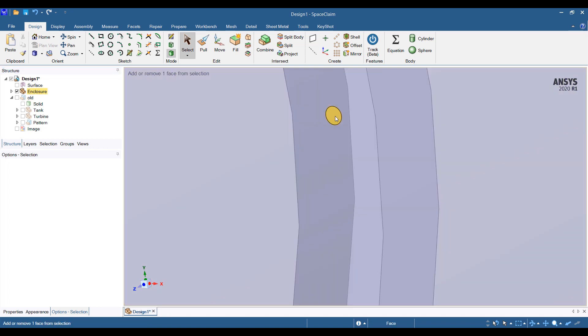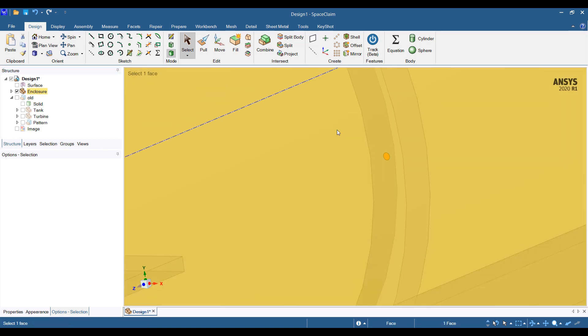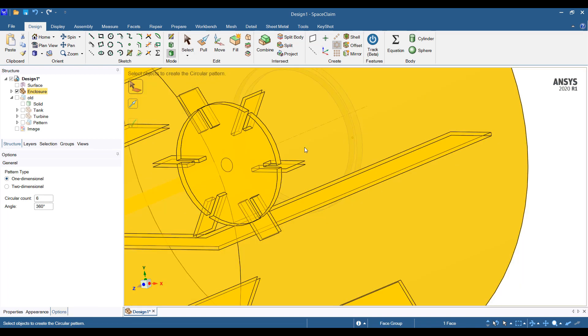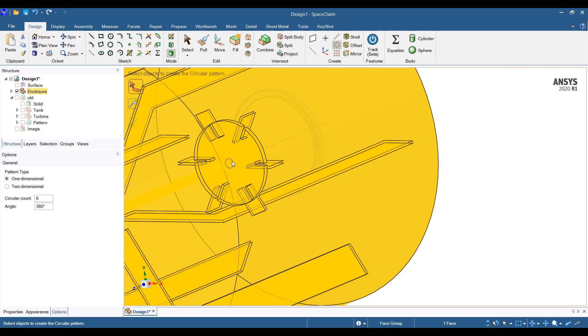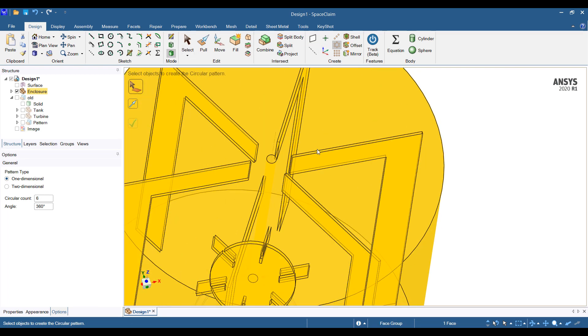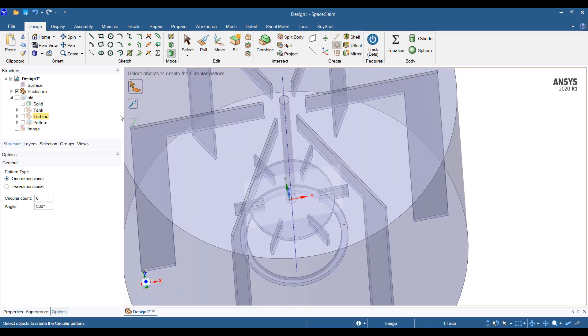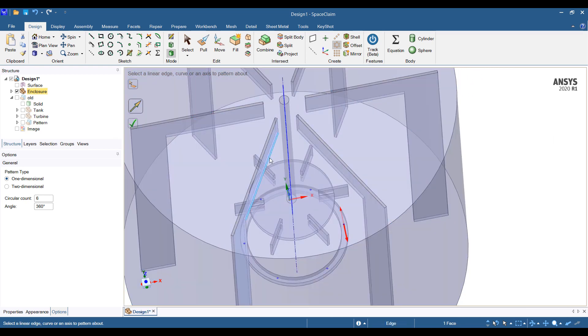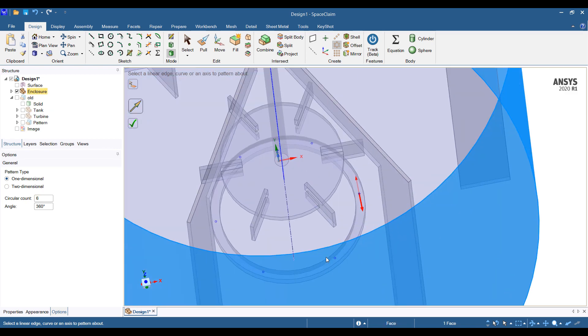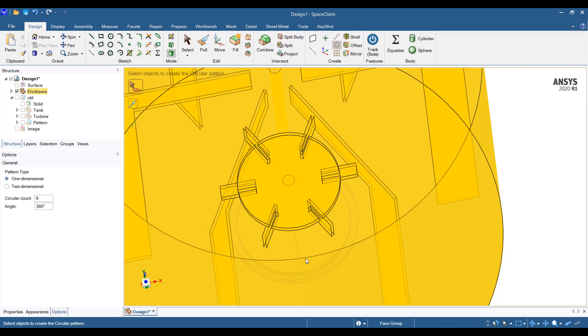So there's still a little surface that we've created. So we will use the option to revolve around this. And just like before we want six of these things. So let's go ahead and do that.